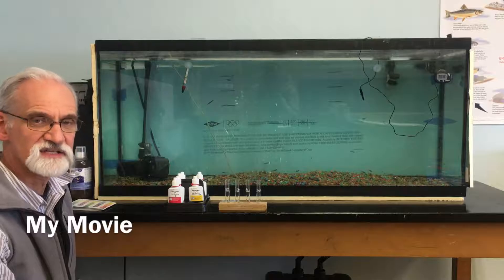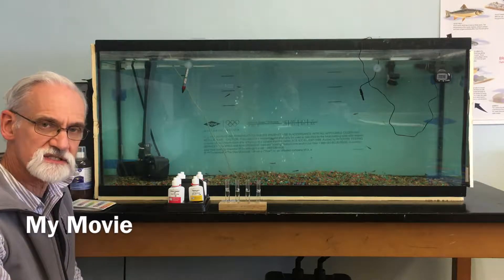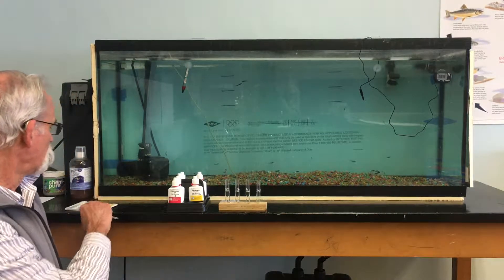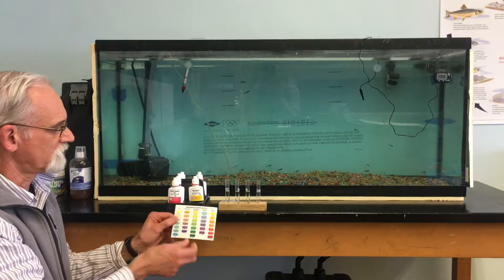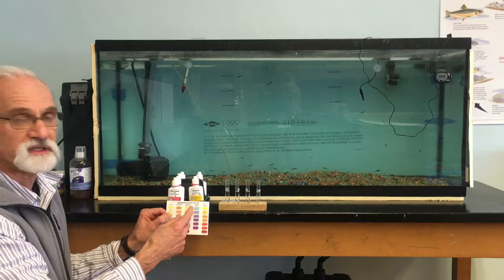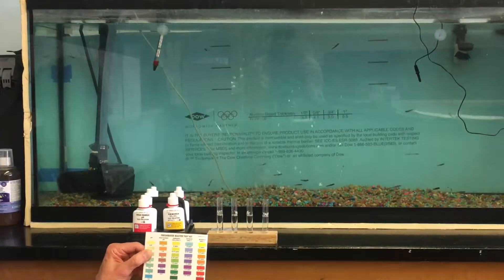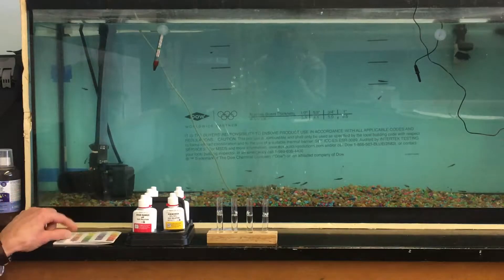I'm going to run through the process for doing these water chemistry tests. There are four tests that we run in the order written on the color sheet: we're going to test for pH, ammonia, nitrite, and nitrate. Don't confuse the last two — nitrite and nitrate are two different tests that sound very similar.